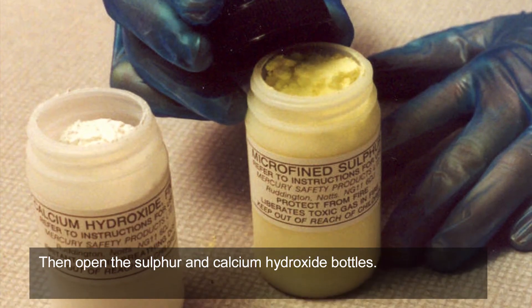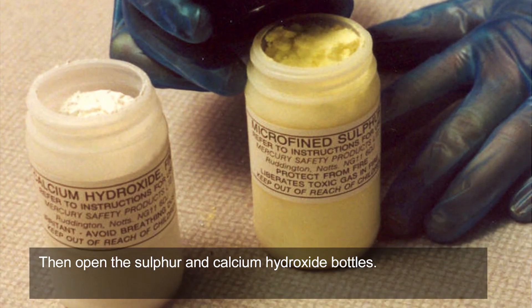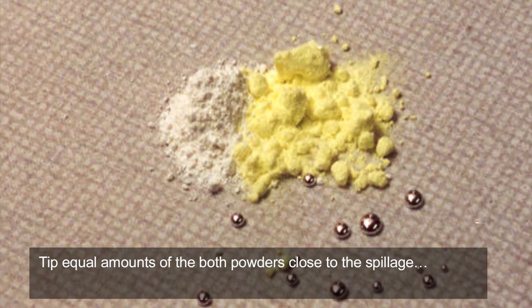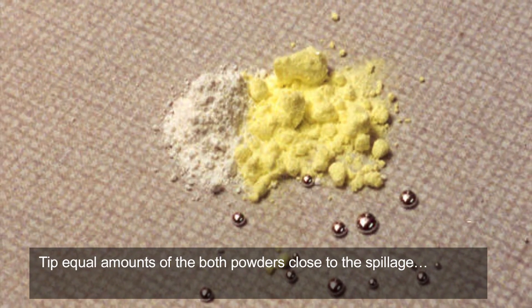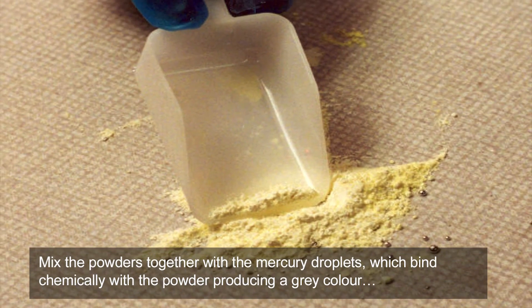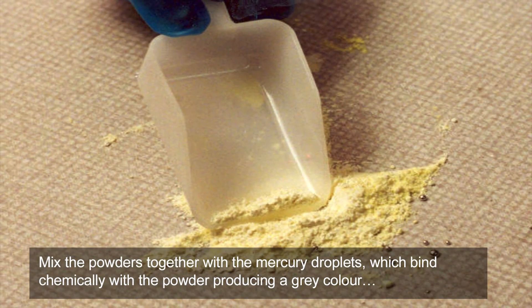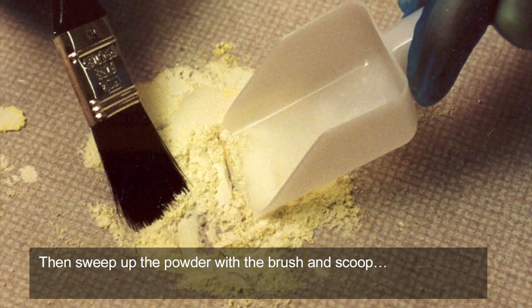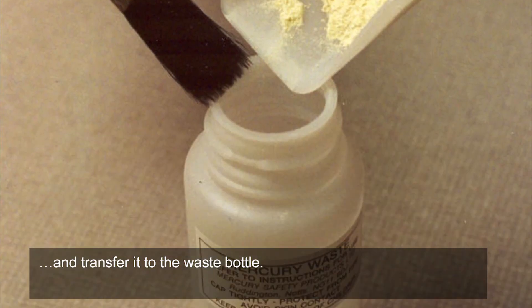Then open the sulphur and calcium hydroxide bottles. We are going to use a mix of these powders to collect the remaining mercury and decontaminate the surface. Tip equal amounts of both powders close to the spillage. Mix the powders together with the mercury droplets, which bind chemically with the powder, producing a grey colour. Then sweep up the powder with the brush and scoop and transfer it to the waste bottle.